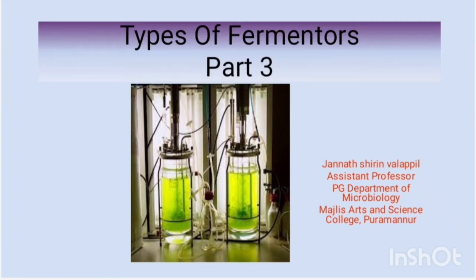Hi everyone. Let's continue with our topic, types of fermenters. We have already discussed 5 different types of fermenters. Now I am going to talk about the remaining 8 different types of fermenters.